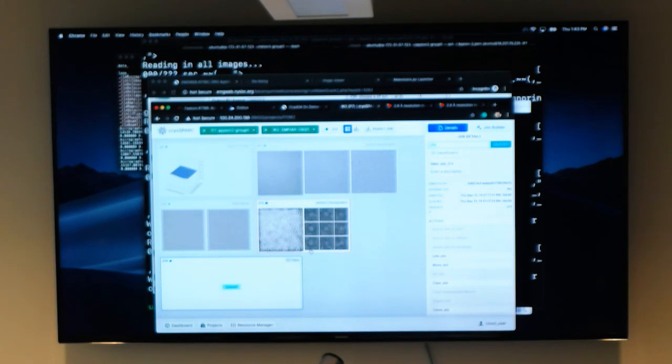CTF correction you already do in Appion, right? Normally yes, but if you run CTF estimation more than once in Appion, it'll seed with the previous number to do the second round. But why I mention that is that just because you do CTF estimation doesn't mean it estimates correctly, and you could apply a wrong CTF estimation. Let's say you have the wrong pixel size or the wrong magnification. You just fed wrong information to it, and it might fit, but it may not be optimal or account for the data.